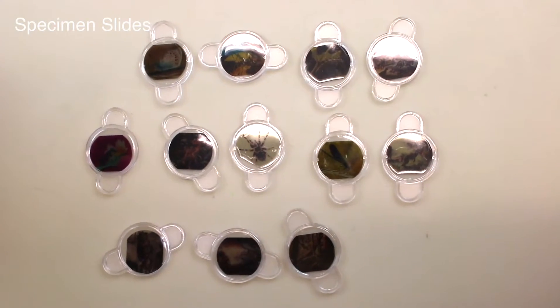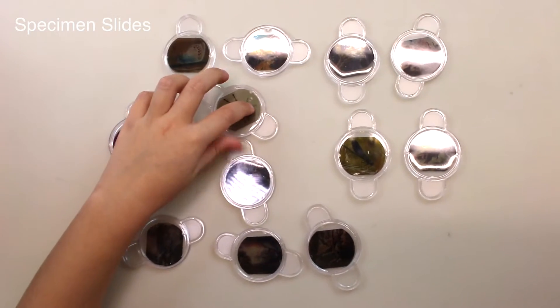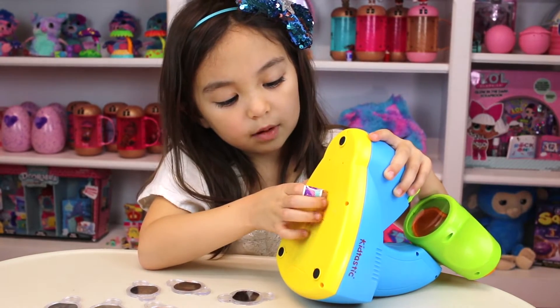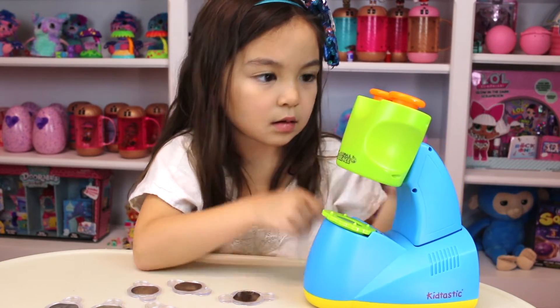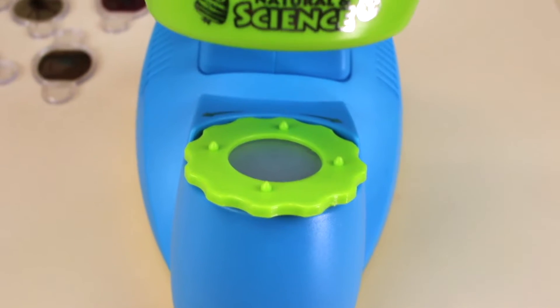These are the specimens. It's kind of hard to see without a light underneath — that's what the microscope is for. We have to turn it on and put batteries in. And then when you turn it on, the light turns on.